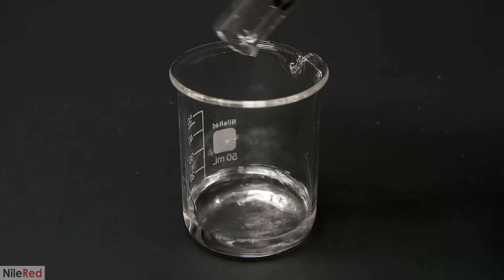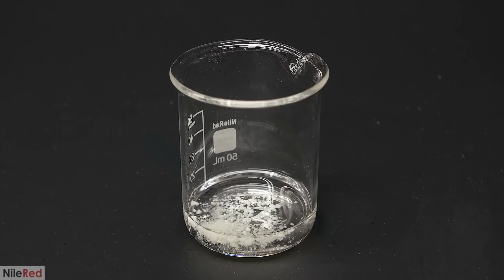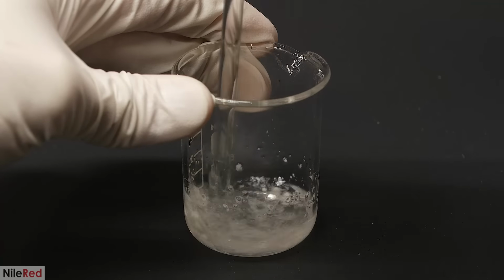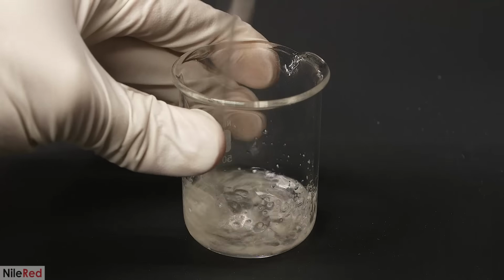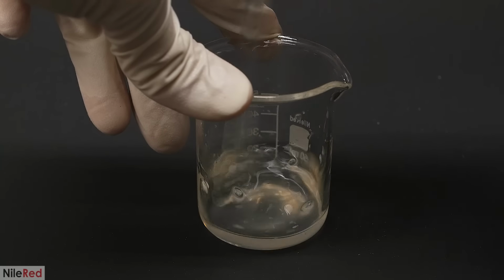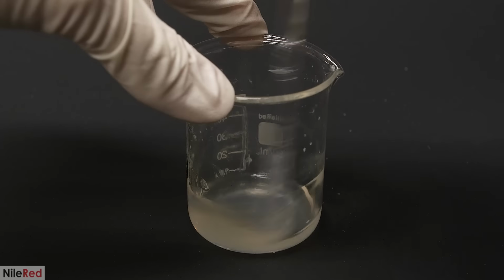Anyway, I moved on to trying the same things with the triacetate, except this time I can't use acetone. The triacetate isn't soluble in it, so instead I use a mixture of 9:1 DCM to methanol. I started with a bit more solvent than I needed here, so I just kept adding the triacetate until I got to a saturated solution.